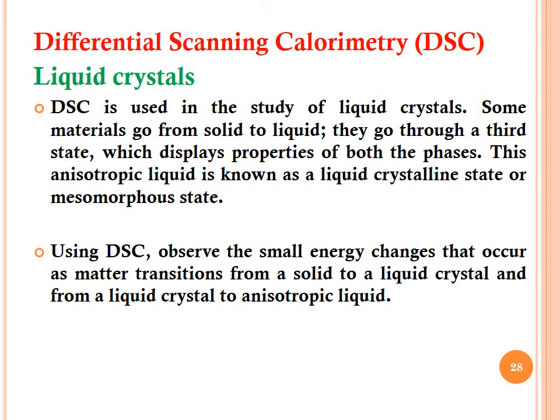Liquid crystals. DSC is used in the study of liquid crystals. Some materials go from solid to liquid. They go through a third state which displays properties of both phases. This anisotropic liquid is known as the liquid crystalline state or mesomorphic state.